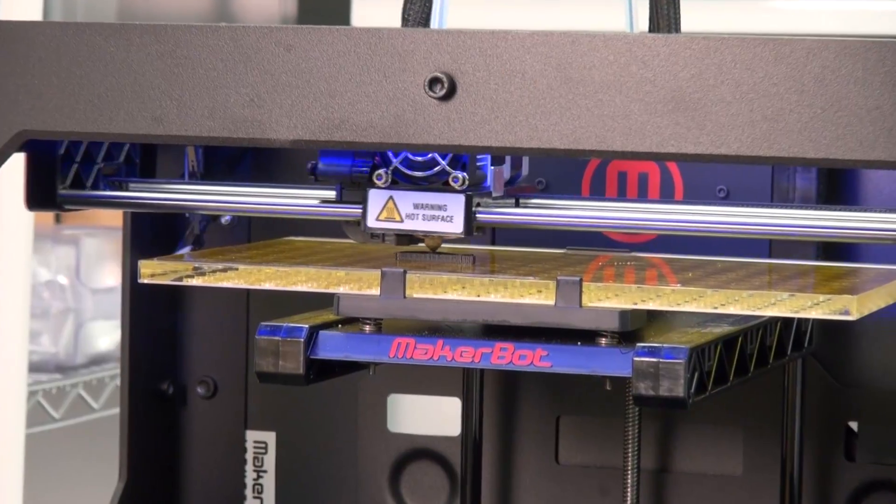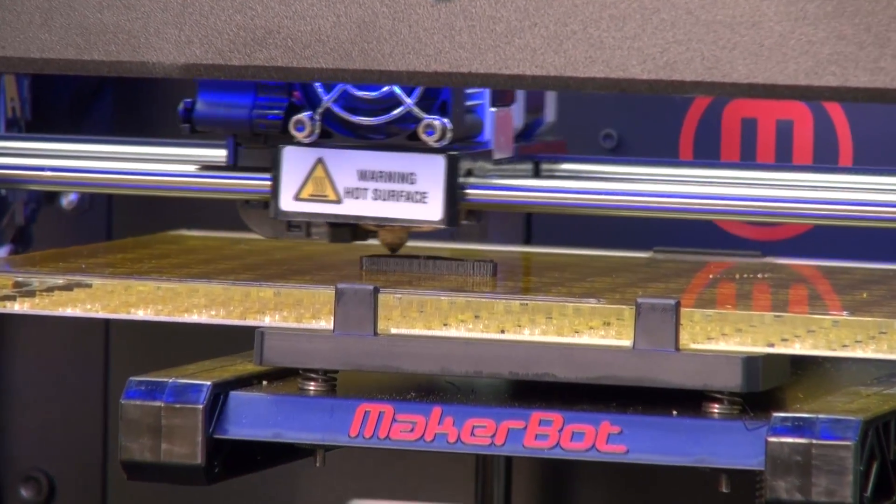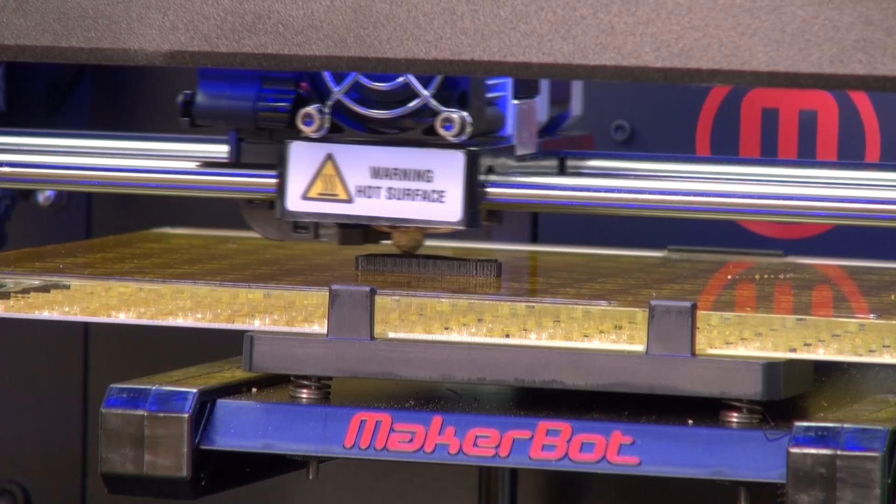PNNL is making the designs available online so that anyone with access to a 3D printer, including school districts, can make their own microscopes.